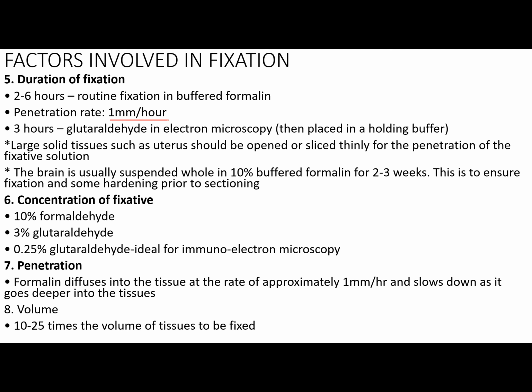Then the brain is usually suspended whole. The brain, class, is whole. You suspend it whole in 10% buffered formalin for 2 to 3 weeks. That long, class. Almost 1 month, 2 to 3 weeks, to ensure accurate fixation and some hardening prior to sectioning.